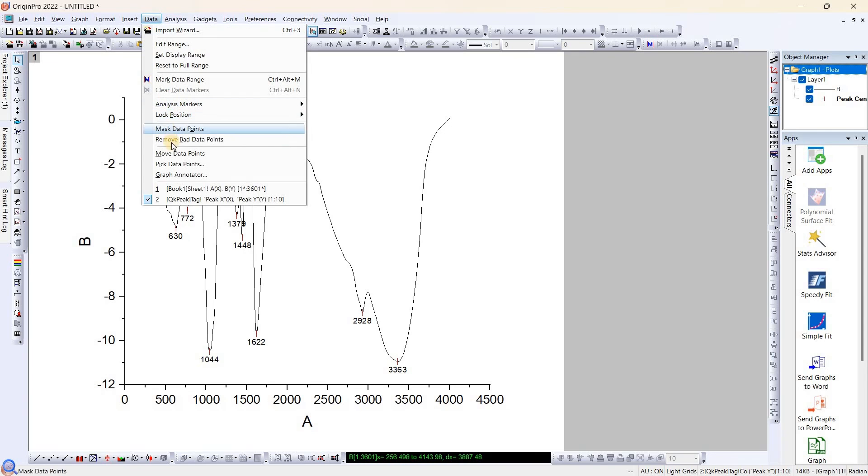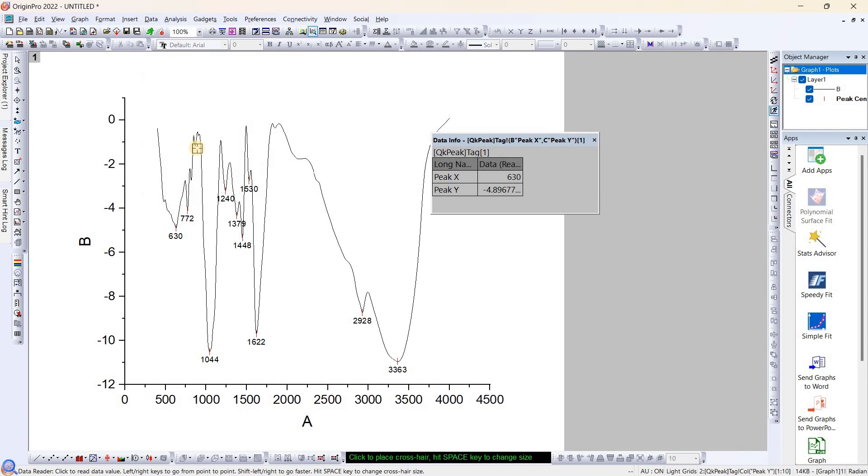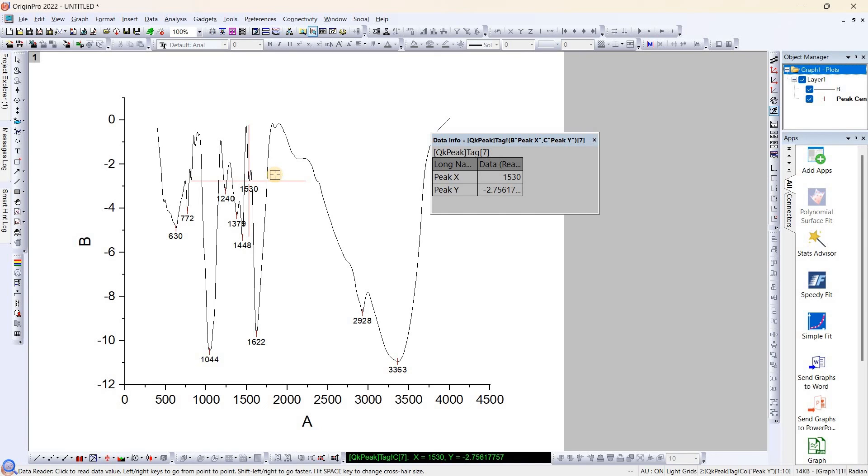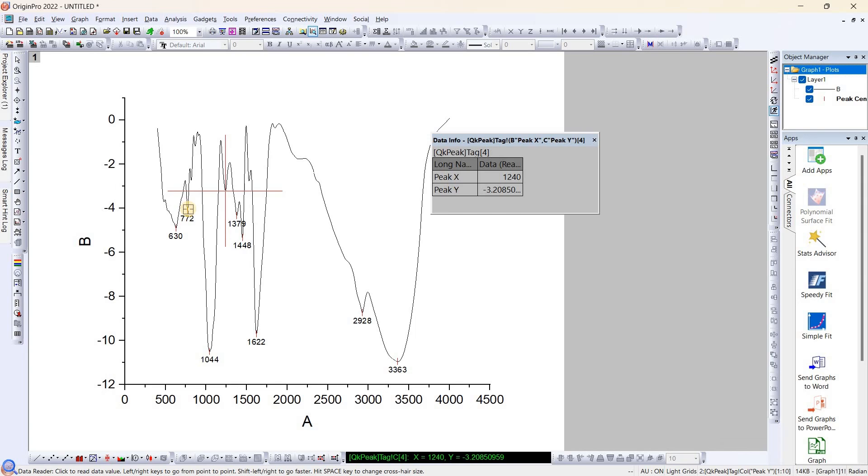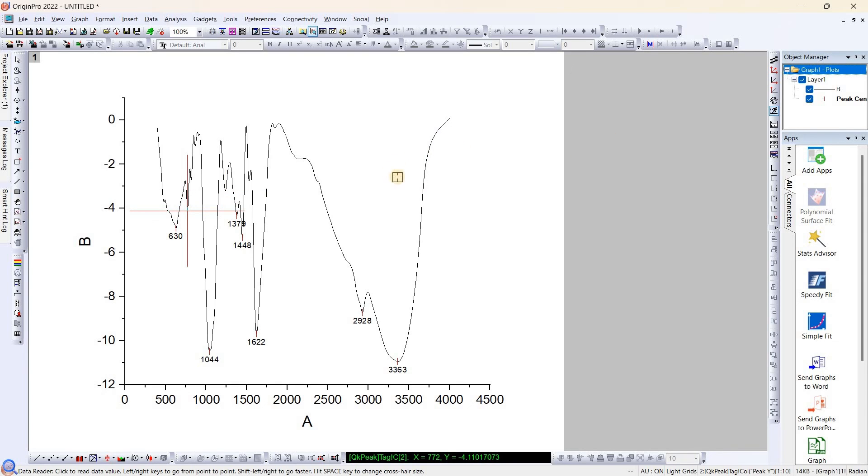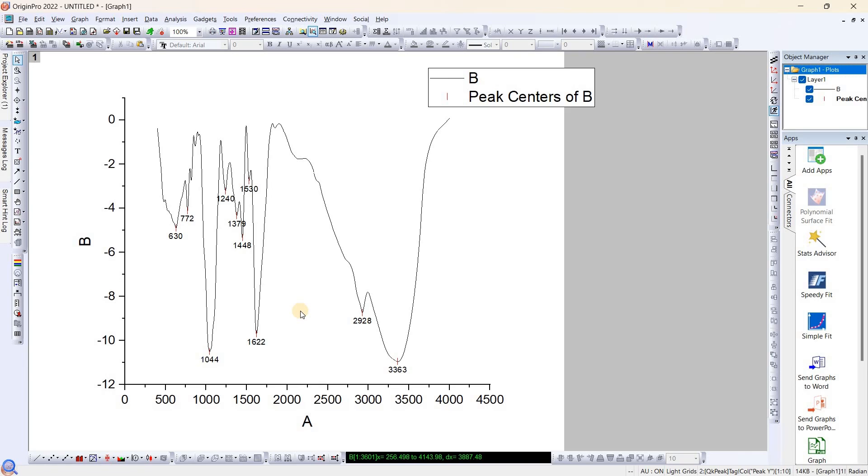Now you can see, simply just hover your cursor nearby the peak you want to remove, select it, it will automatically snap that point and press Enter, so it will remove that data point. Again, if you want to remove this, select this point and press Enter. This is how easy it is. You can remove unwanted data points from your plot. Thank you so much.